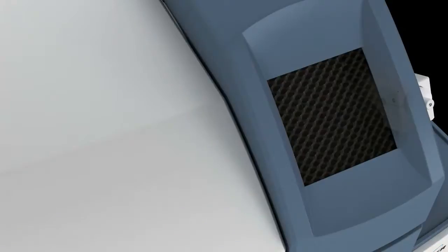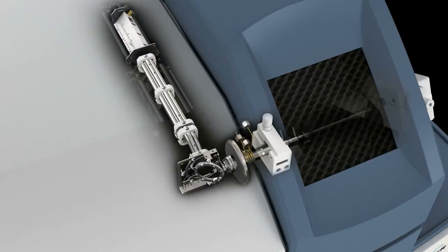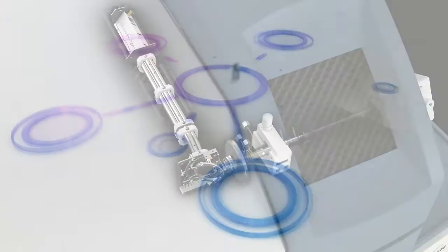The Aurora M90 combines exceptional performance and low maintenance through technological innovation, providing the ideal analytical tool for your laboratory. Let's explore further.